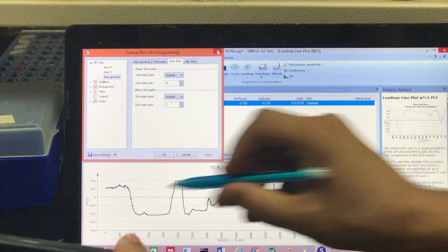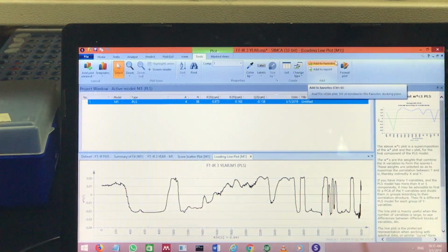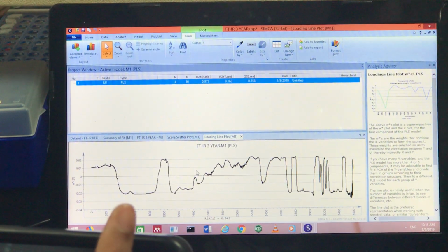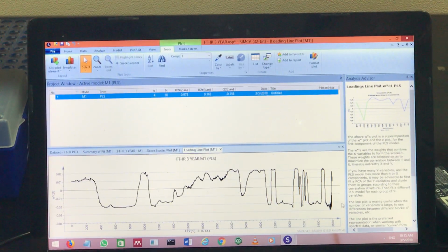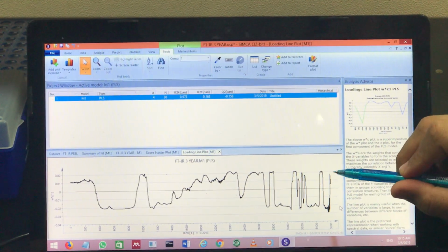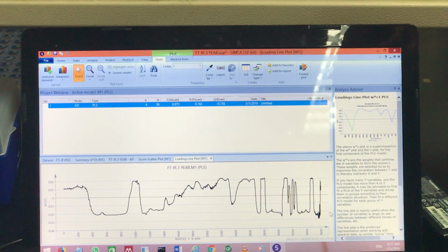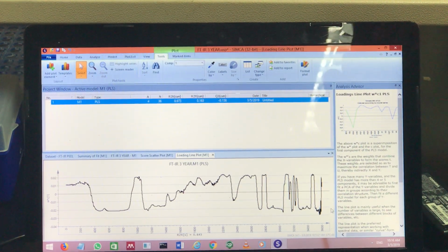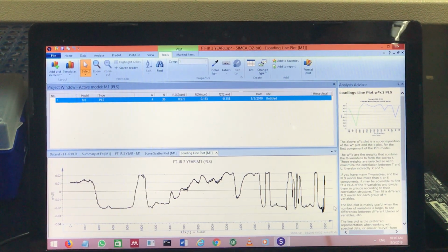Okay, this is the UV, this is the FTIR result, and you can see the start. This is the IC50 or the inhibition. This is the last line usually. If it appears up, because we use the inhibition, usually we go by the IC50 value. If the last line, as Dr. Alfi told you, is up, that means the activity is down.